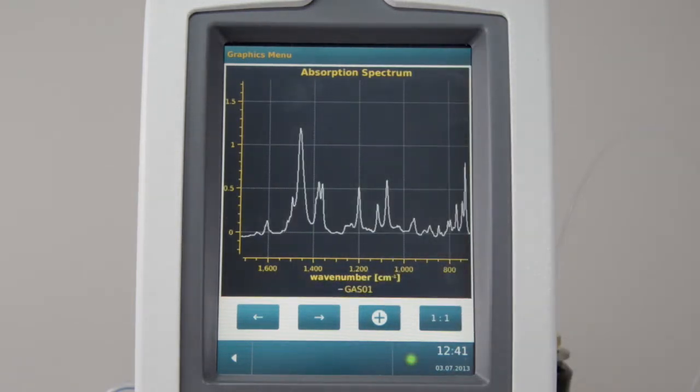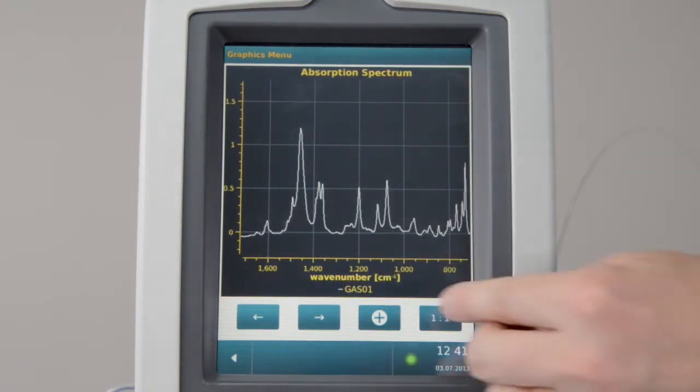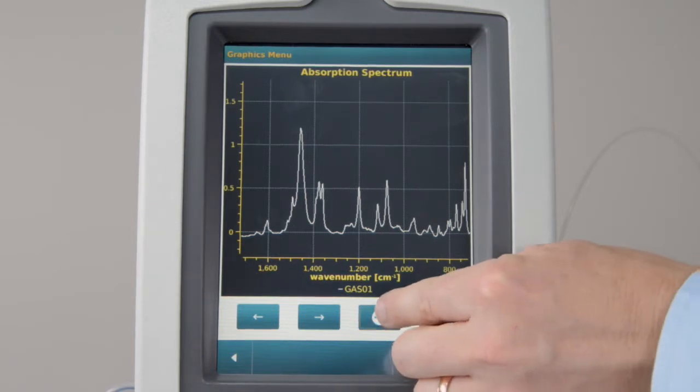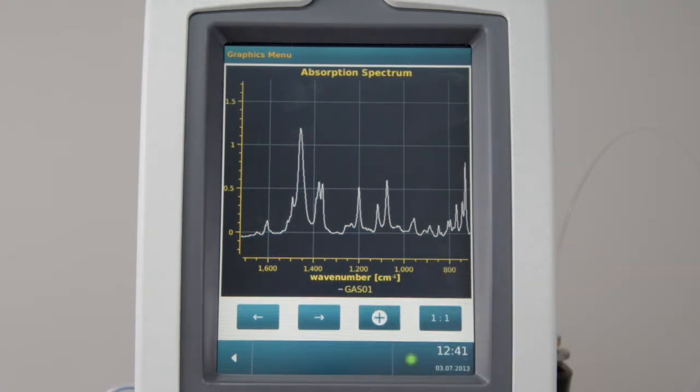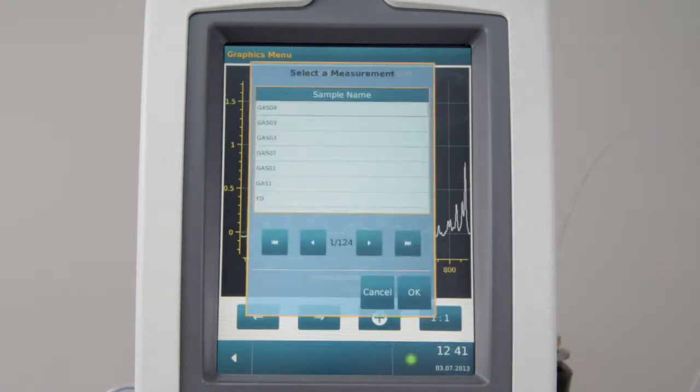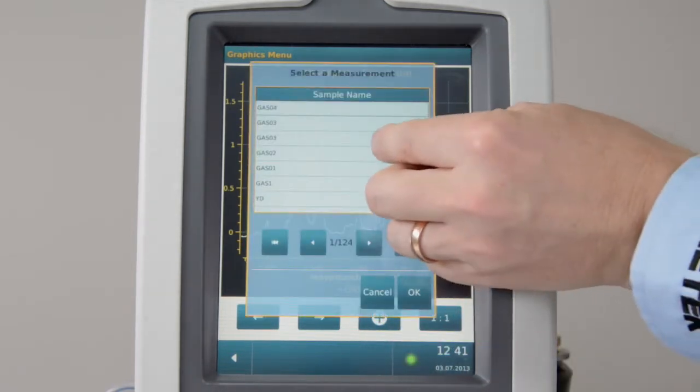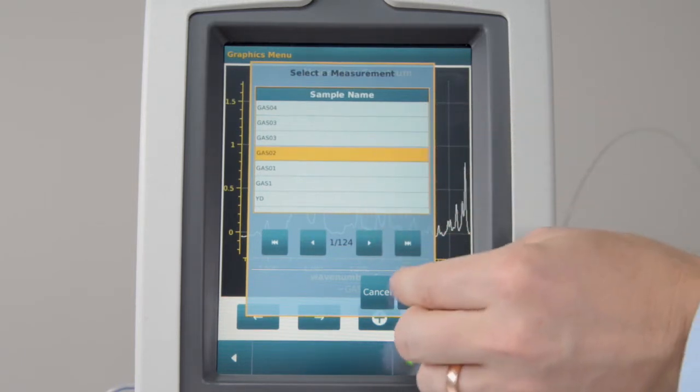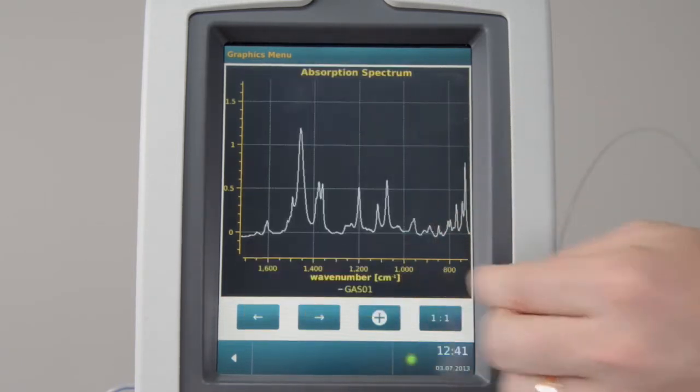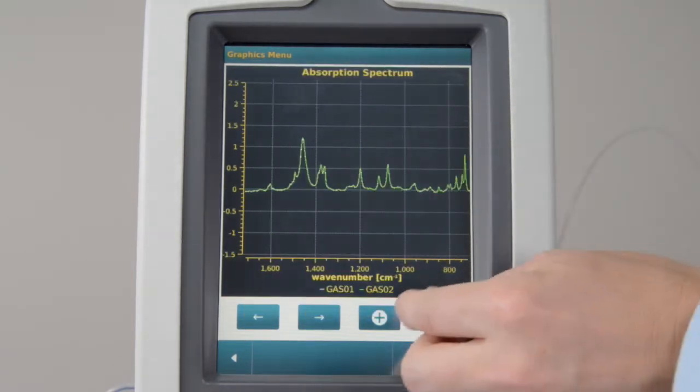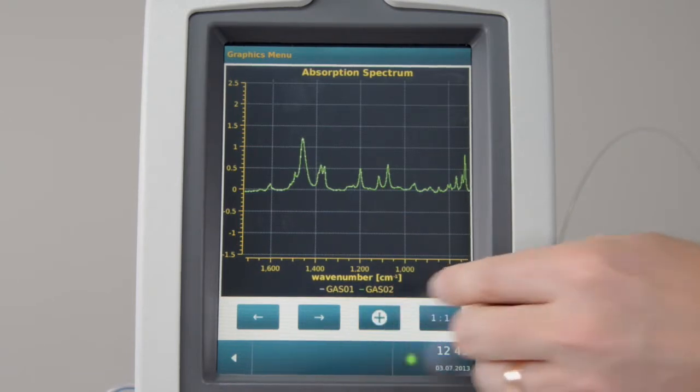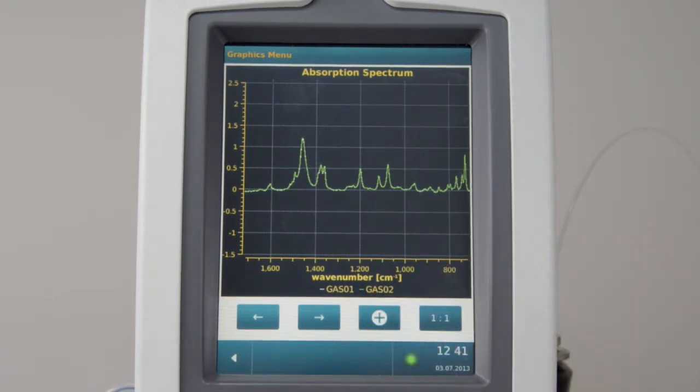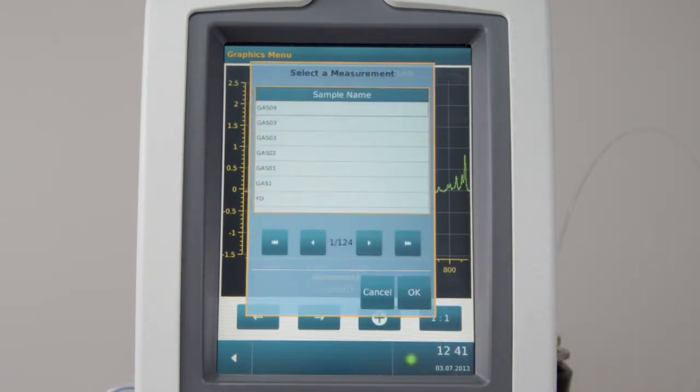For spectrum comparison, press Plus and add another spectrum from the results list. You may select an unlimited number of spectra for comparison on the screen.